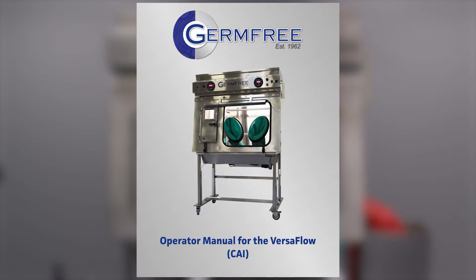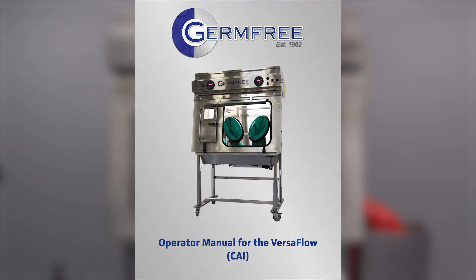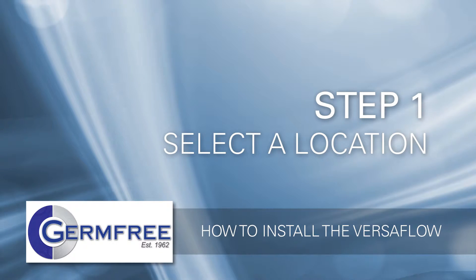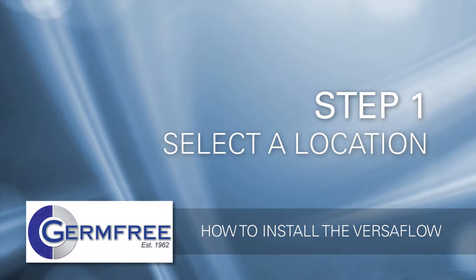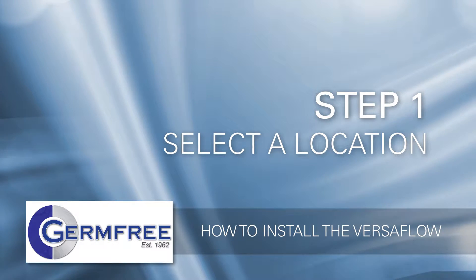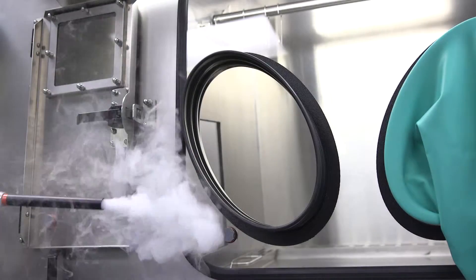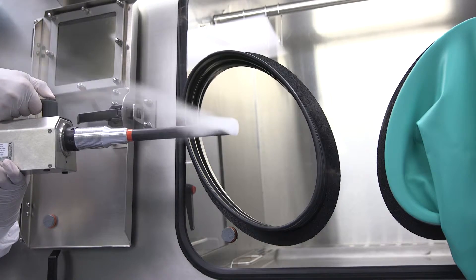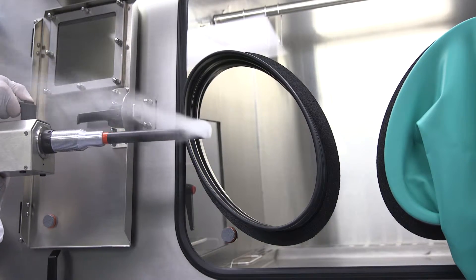A detailed checklist is in the Versaflow user's manual. The first step is to select the location to place your Versaflow. State regulations pertaining to room access or professional considerations may impact where you place your Versaflow. Unlike an open front hood, room air currents will not adversely affect the quality of compounding done in a Versaflow. This gives you a lot of flexibility when considering just where to place a unit.